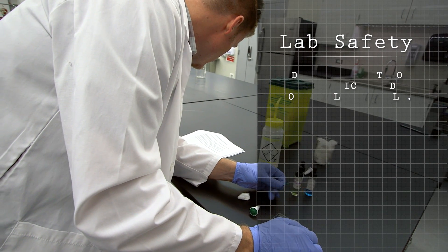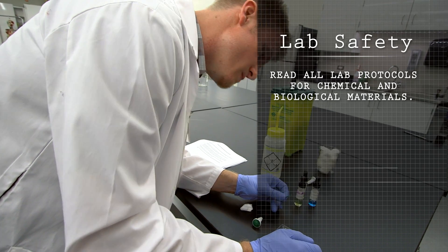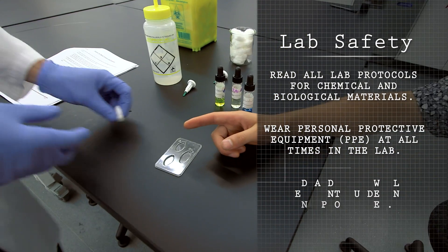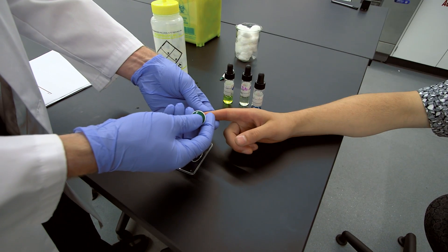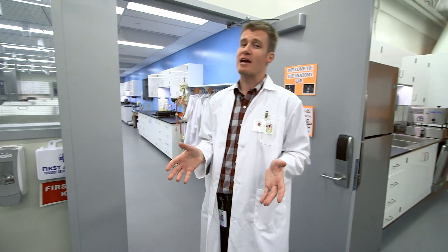For everyone's safety, make sure that you read all the lab protocols. When working with chemicals and biological materials, you often need to wear personal protective equipment — most commonly gloves. Read all of the steps to a procedure before you begin an experiment, as you will not have enough time to restart if you miss key steps. If at any time you have questions or are unsure of any instructions, please just ask one of your instructors — we're here to help.